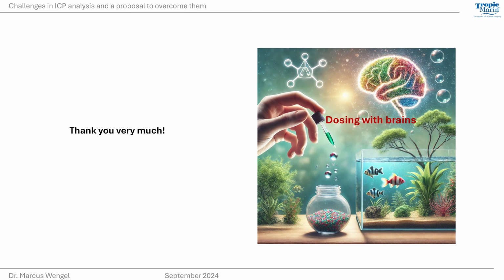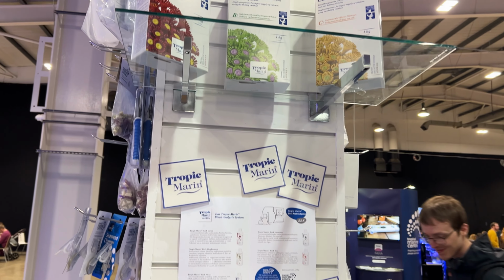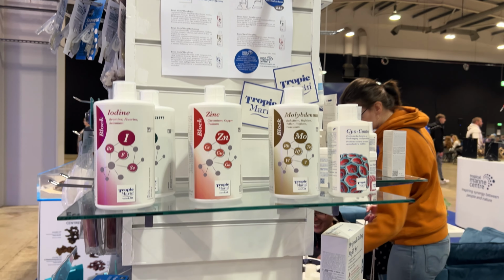So at the end, maybe it's the idea of dosing with brains, thinking about what ICP is good for and what ICP is not so good for. It's a really good thing that we have ICP, but we need to know there are some challenges, and maybe working with some guiding elements, only with the elements you need, could be a good way.